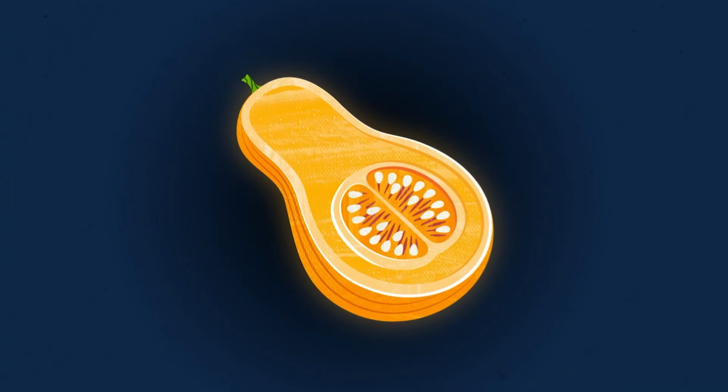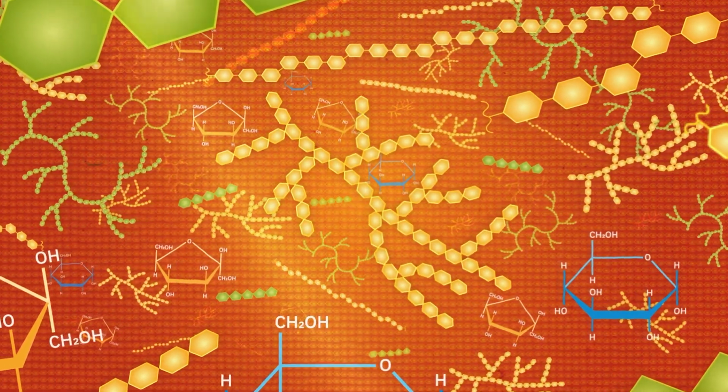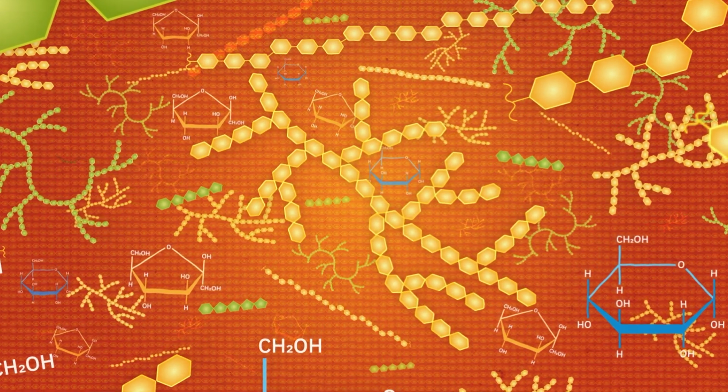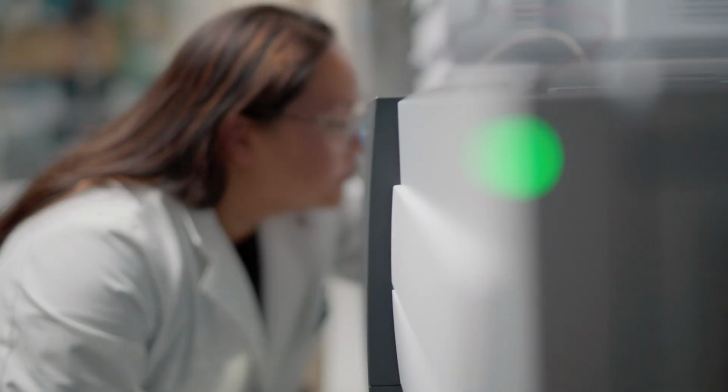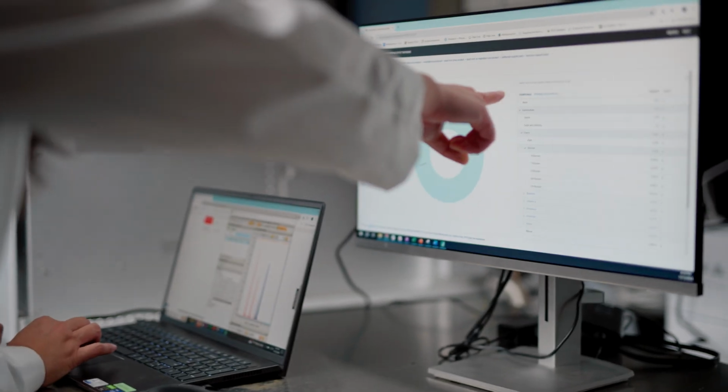The fiber composition analysis is able to separate and quantify 18 different sugars. The fiber linkage method analyzes the 30 most common linkages found in foods. Due to limited commercial standards, we normalize the fiber linkage peak areas to the fiber composition samples.